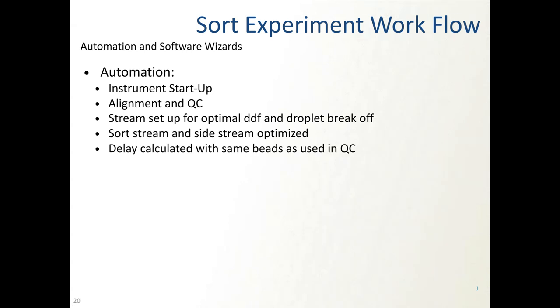And it can be as black box as you want it. You can do it in one click and never see, or you can get into the more service level menus and actually look at the camera images of all the different streams to make sure it looks good to you. There's potential that if you really want to go down the weeds, you can optimize the drive frequency combinations for better resonance and get it to be super, super stable. But so far in our hands, we haven't been having to do that.